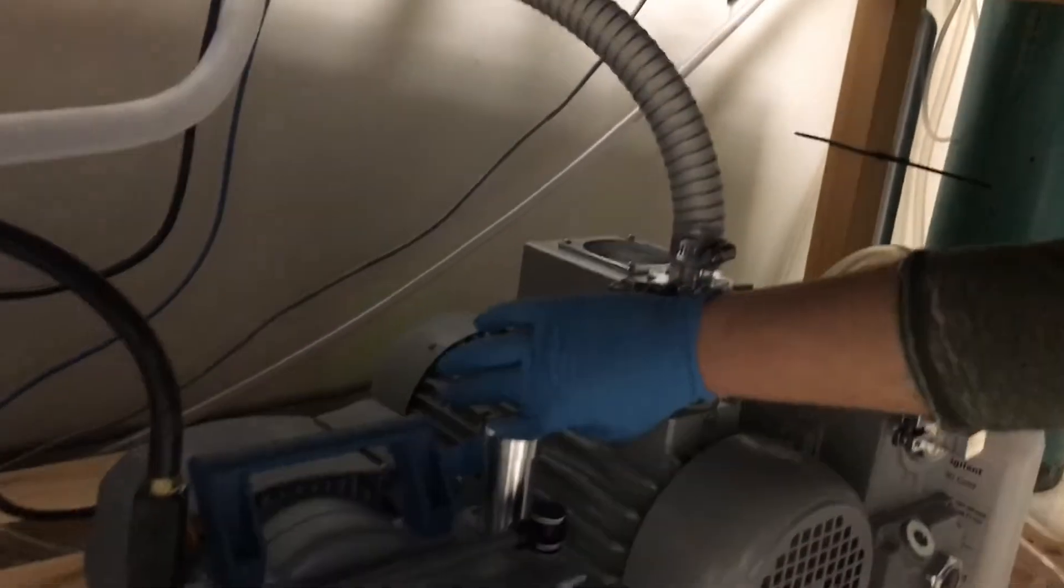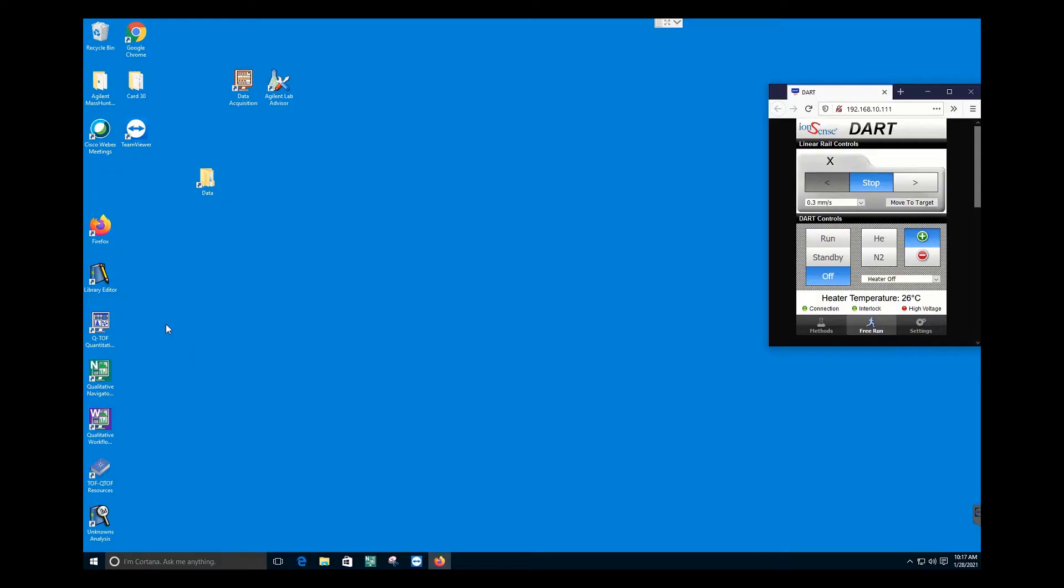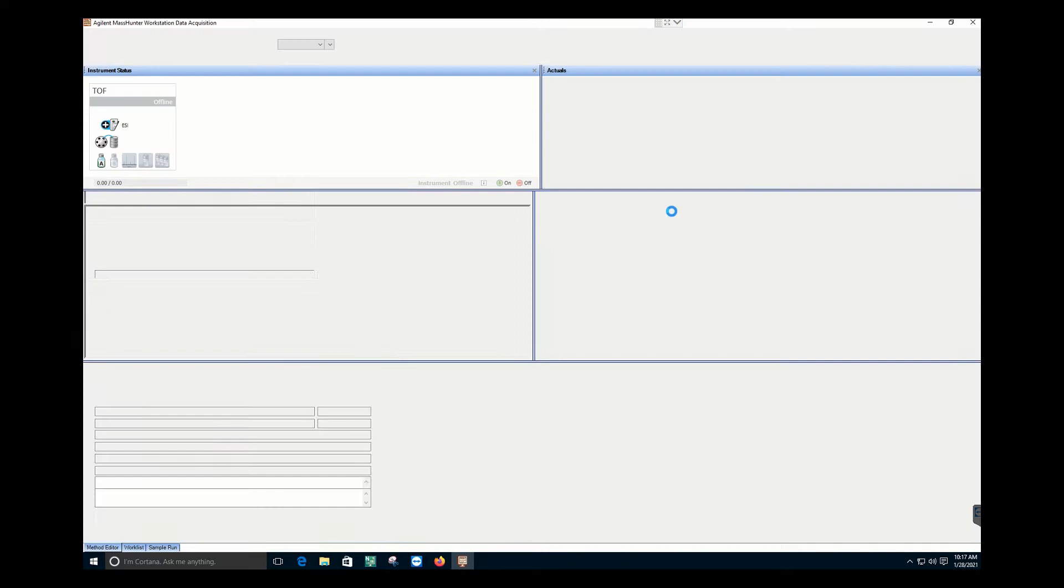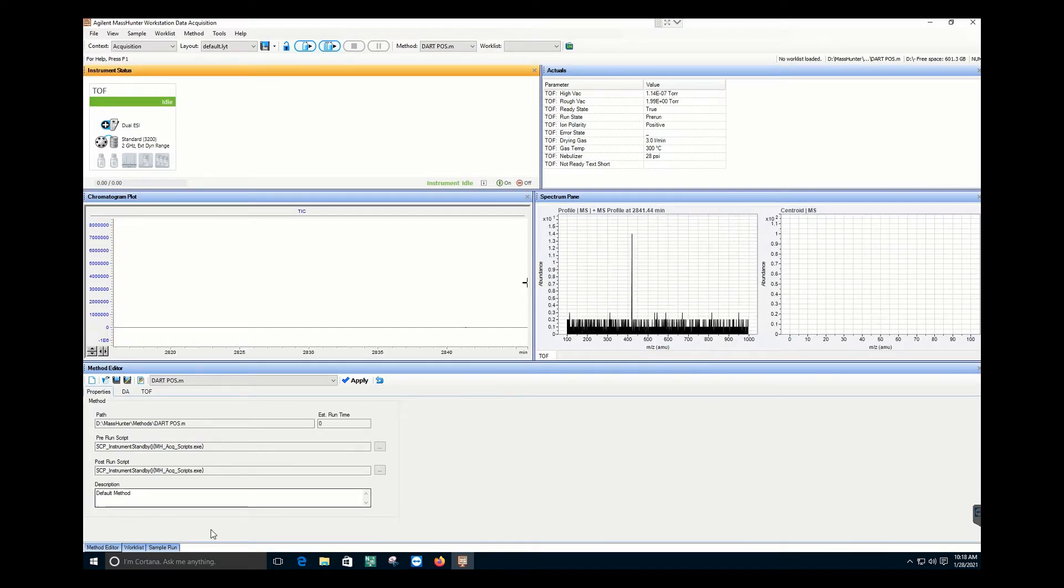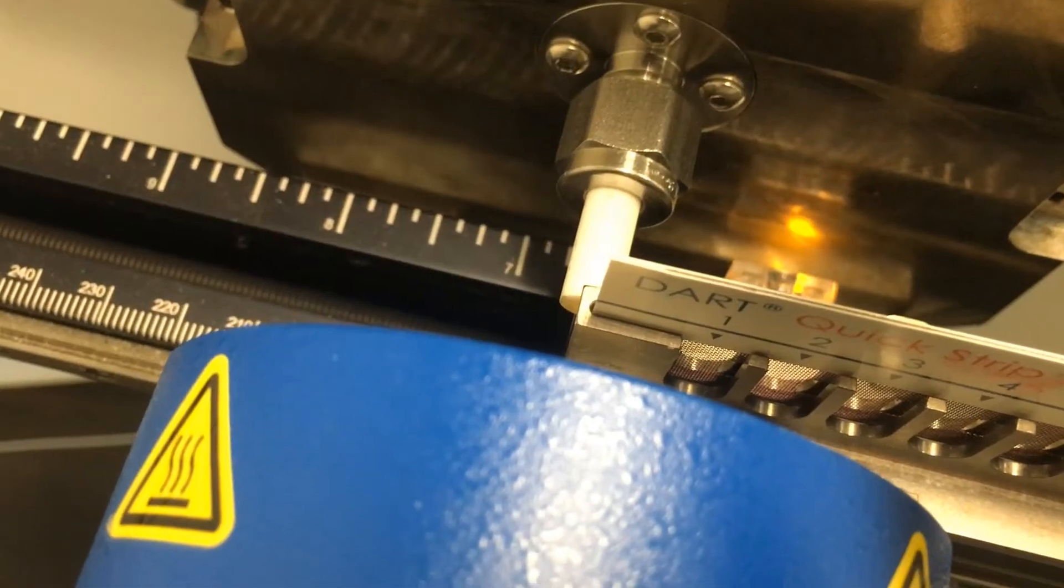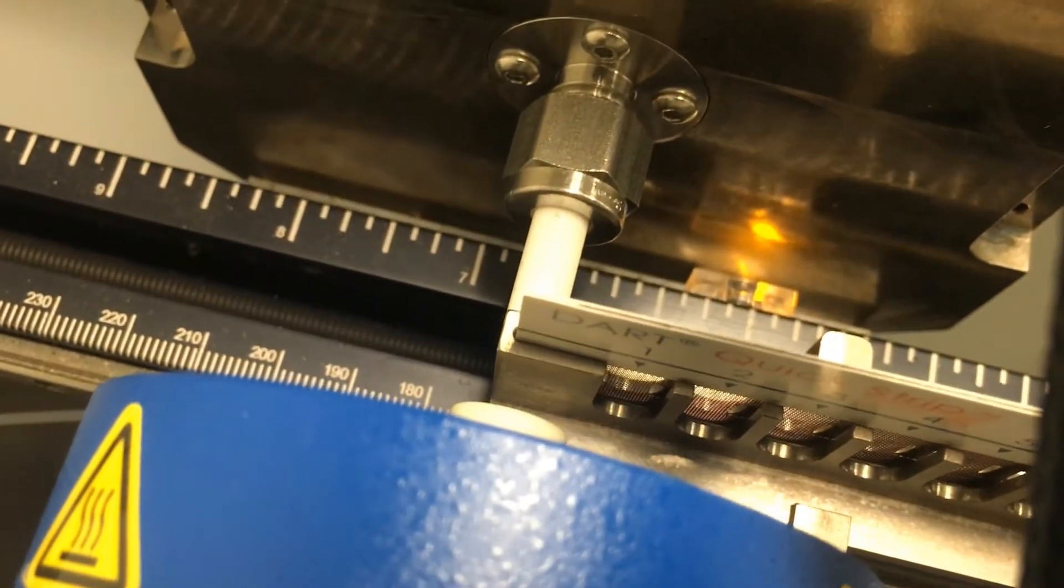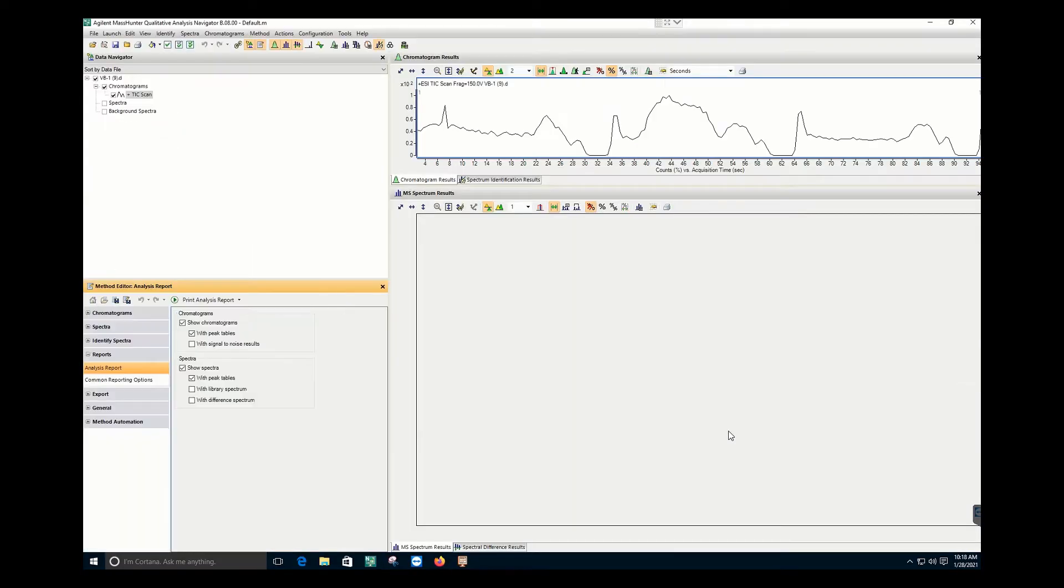DART stands for Direct Analysis in Real Time. It is a new ionization for rapid, non-contact surface sampling of compounds. Operating at ambient pressure with the sample at ground potential, the source enables near instantaneous determination of sample composition by using mass spectrometry. Electronic or vibronic excited state species generated in the source interact with reagent molecules and polar or non-polar analytes present near the inlet of the mass spectrometer.